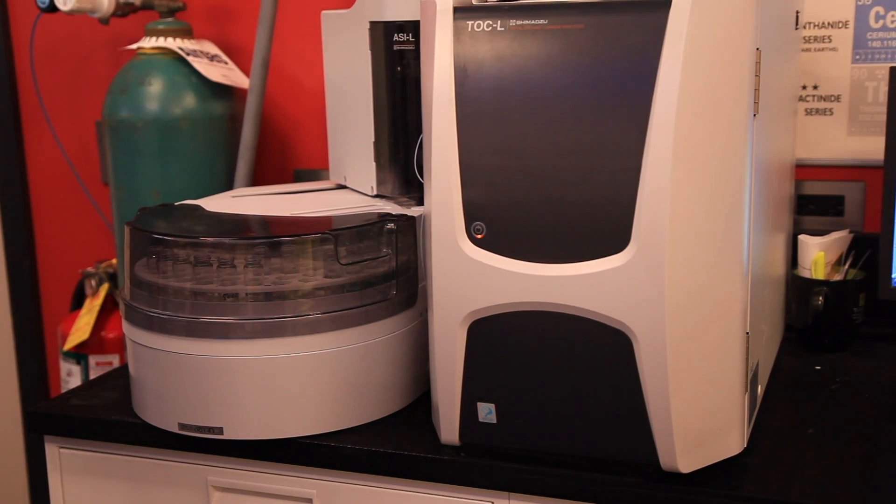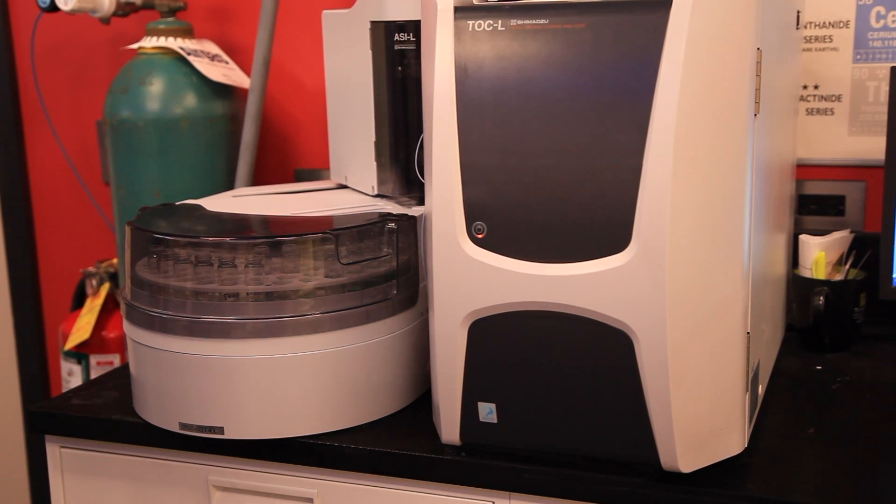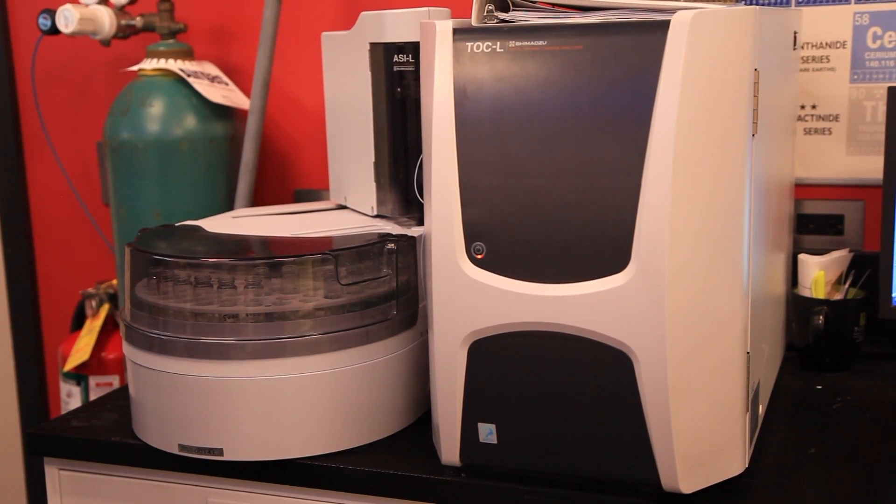And here we have a total organic carbon analyzer that's used to analyze organic carbon that's in our nickel solutions, to allow us to know when our nickel baths need to be treated.